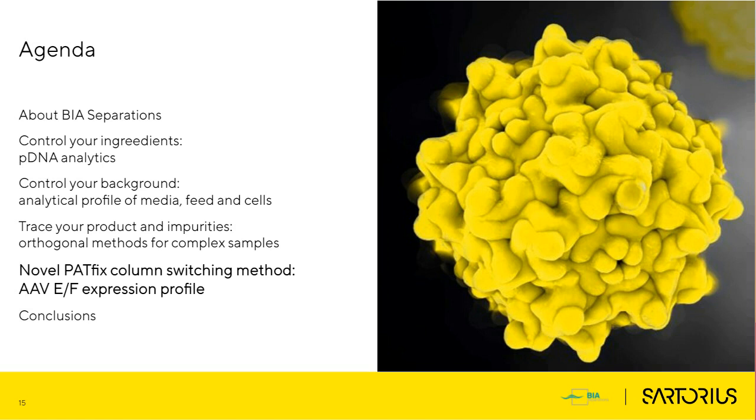However, this type of method is also very useful in the very beginning of your downstream, once you're assessing your sample and deciding what route you want to take, which techniques you would like to try, what different steps you would like to incorporate in your downstream. So let's look at some orthogonal methods that would allow us to estimate empty-full ratio in complex samples.